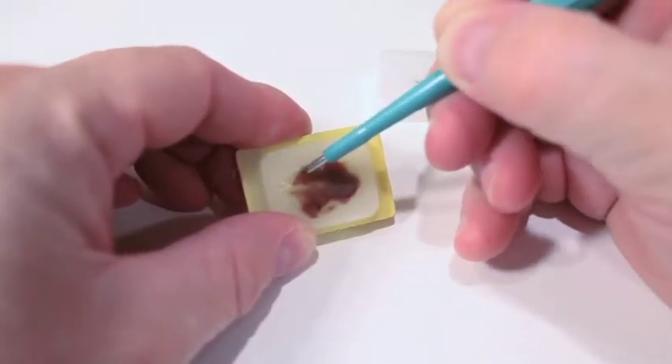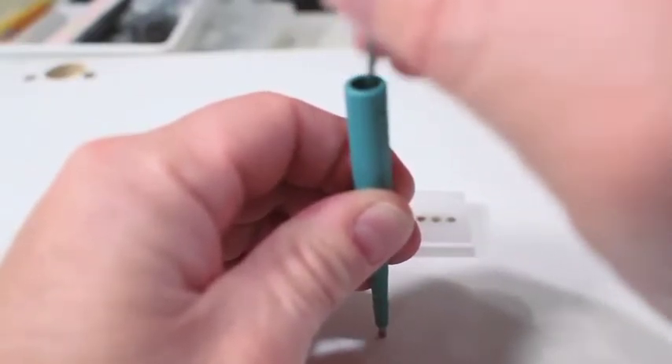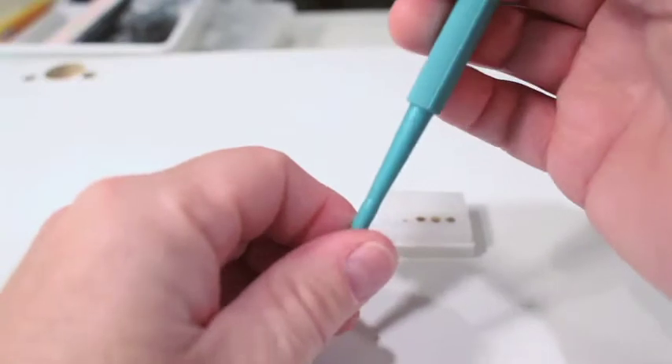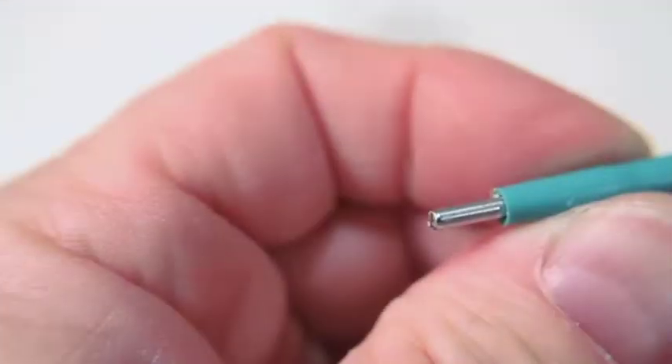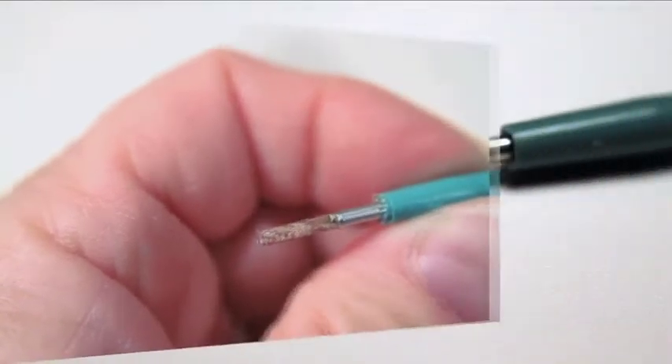Once the tissue is in your needle, you will have to pack the loose samples to make them into a core. Place the needle end down on the table and push the stylet down several times, packing the tissue into a tight core. Now the tissue is ready to insert into your Array Mold Block.